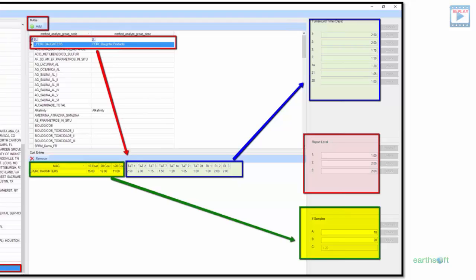For a higher sophistication of the report level, for example level 2, we're going to have samples and a batch of QA/QC. And let's assume that for level 3, which is the highest in this case, we have additional QC, calibration data, instrument logs, and so forth. So that's the meaning of this report level tab.